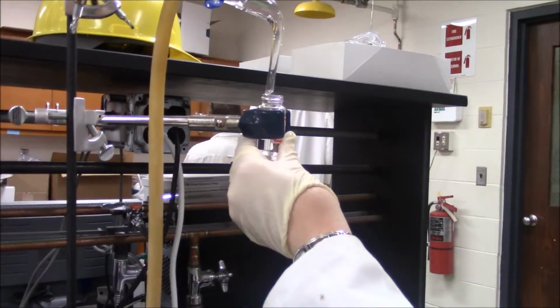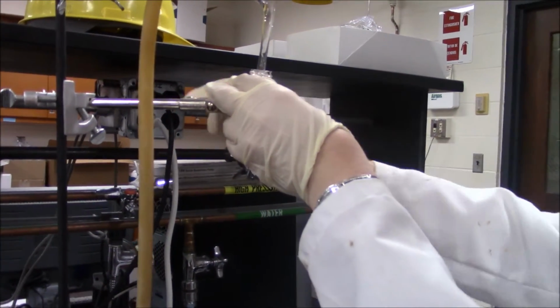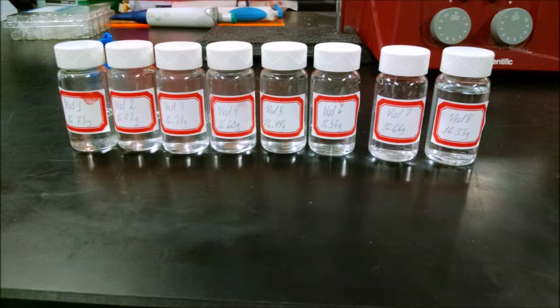The ethanol produced in the distillation should be collected in the 8 20 milliliter vials set up at the beginning of the experiment. Each of these vials should be allowed to fill up approximately to the halfway point, then removed, capped, set aside, and replaced. Make sure that the same caps remain with the same vials. This ensures that the mass of each vial itself, without the ethanol solution, is the same at the end of the experiment.